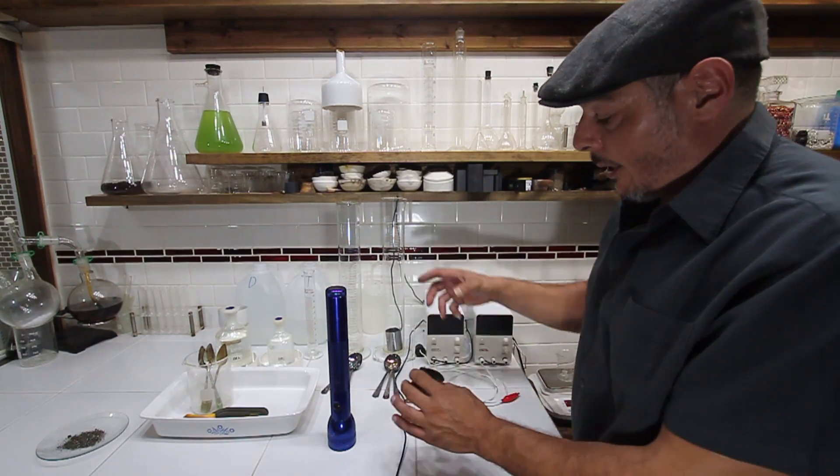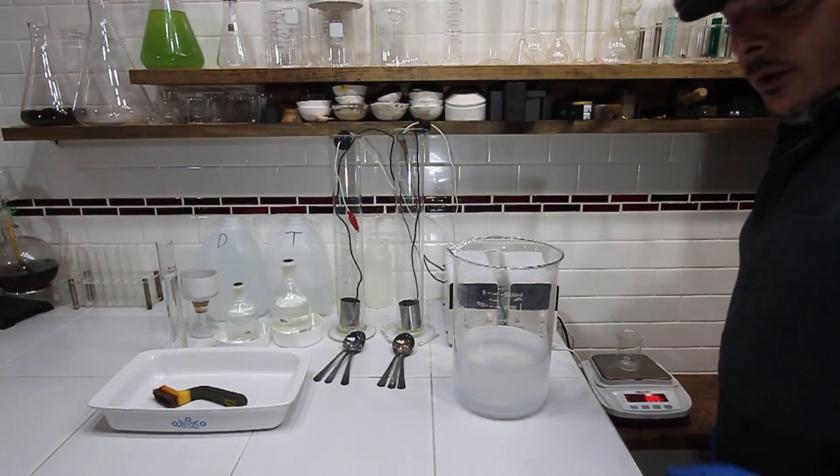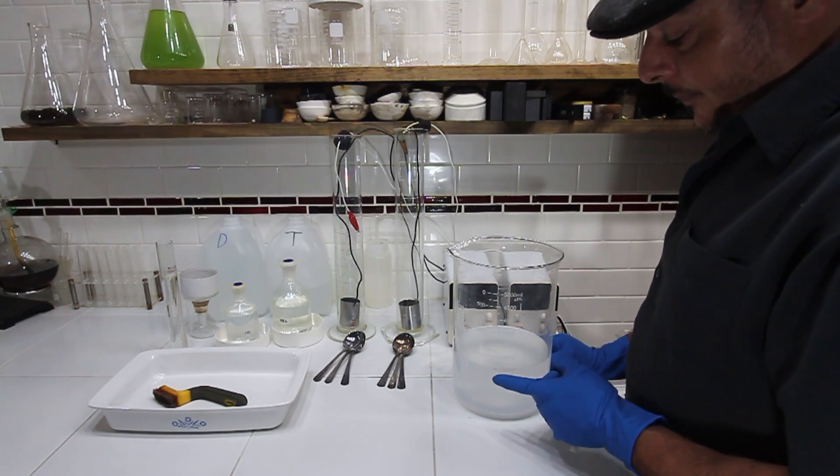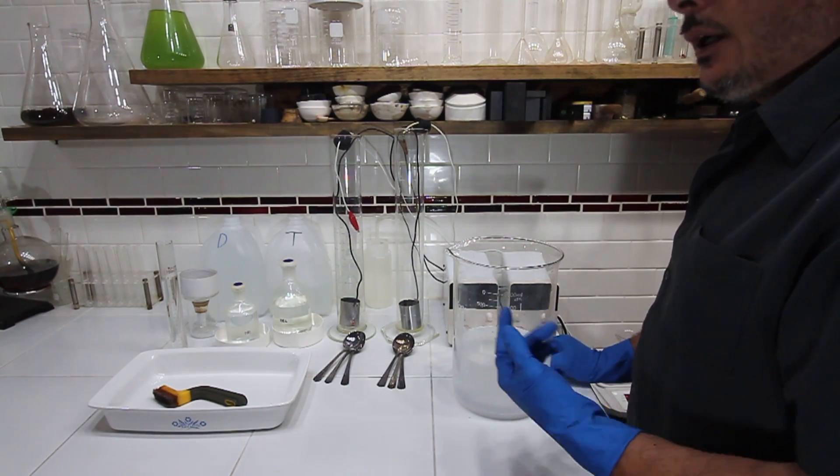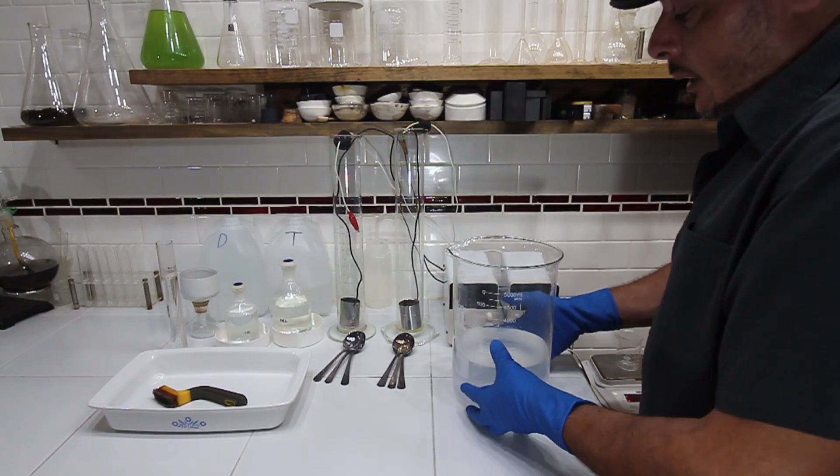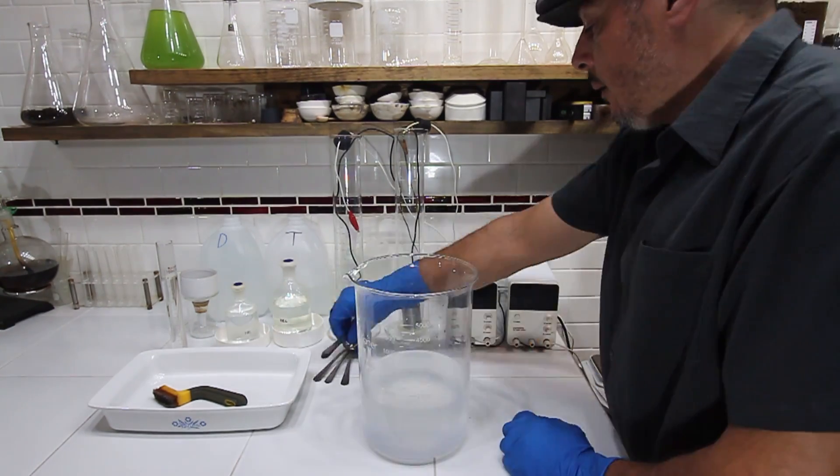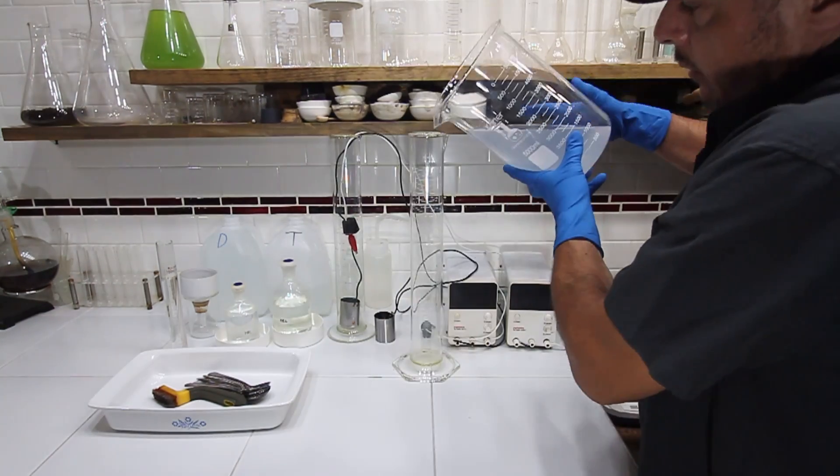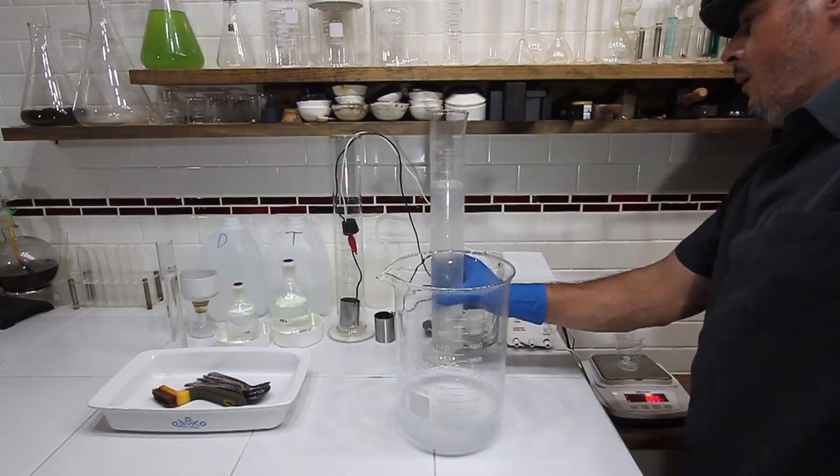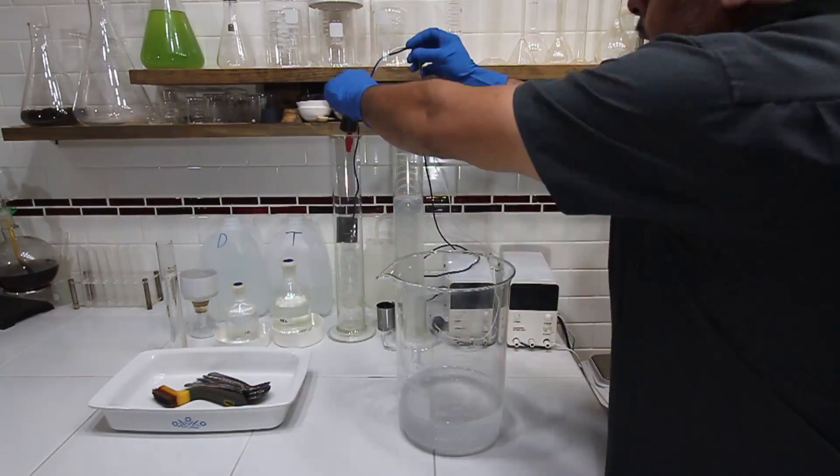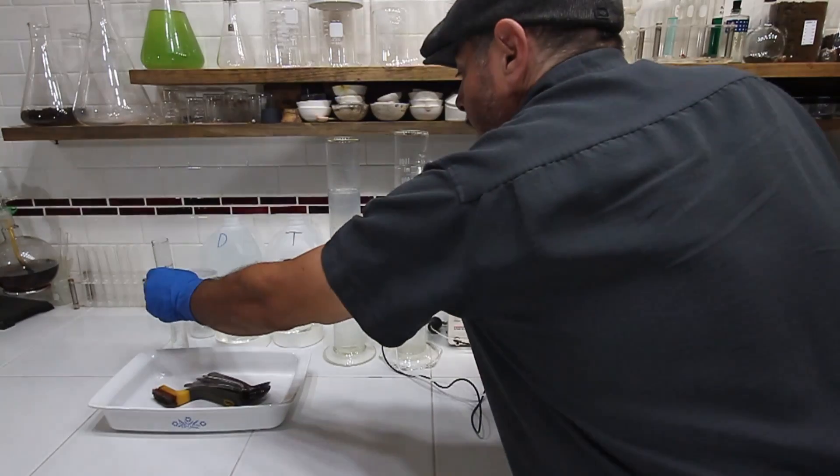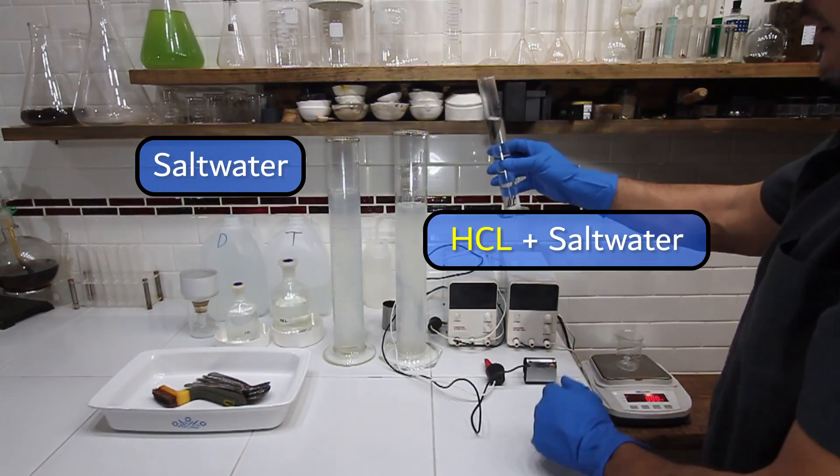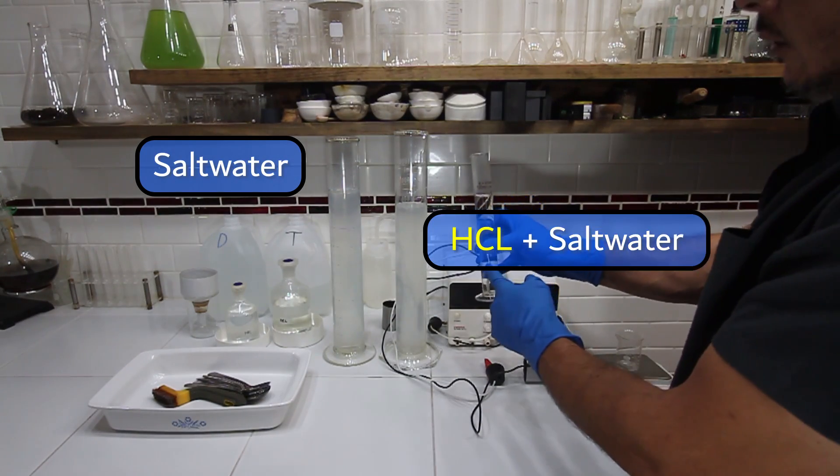So we have our saltwater dissolved—two liters of tap water and 200 grams of just regular table salt. What we'll do here is in a graduated cylinder, we're going to add 100 milliliters of hydrochloric acid.